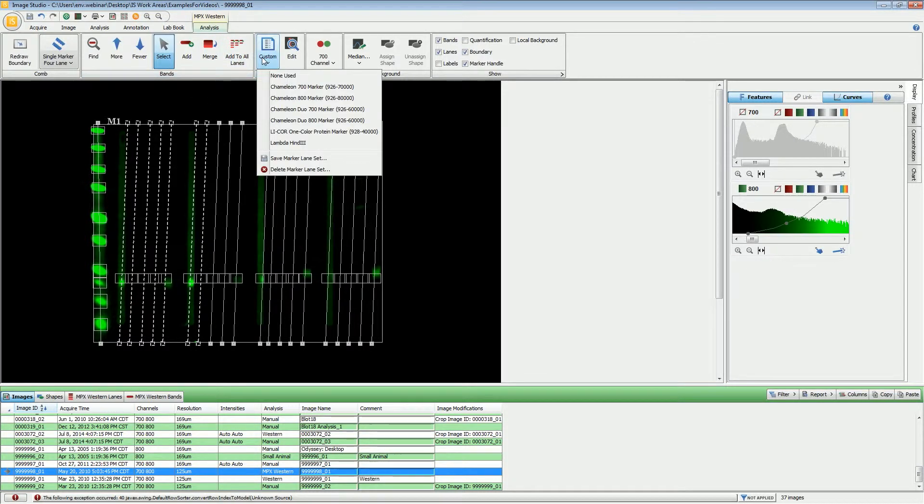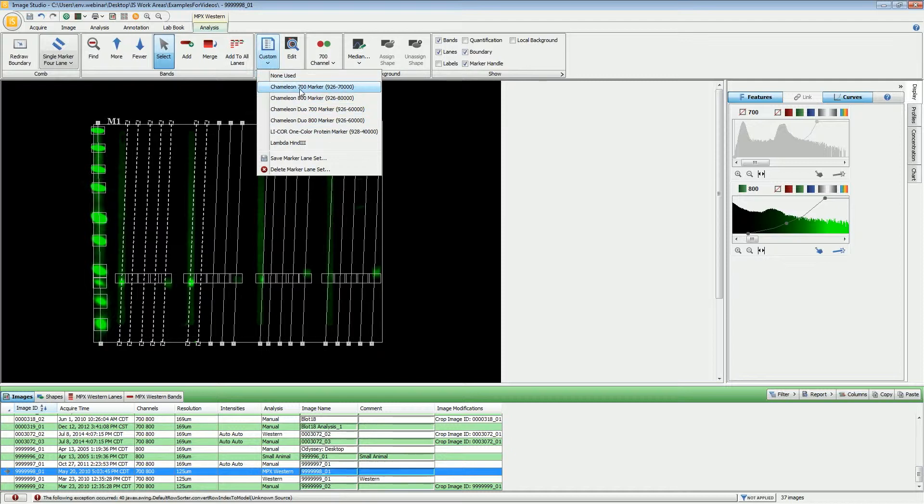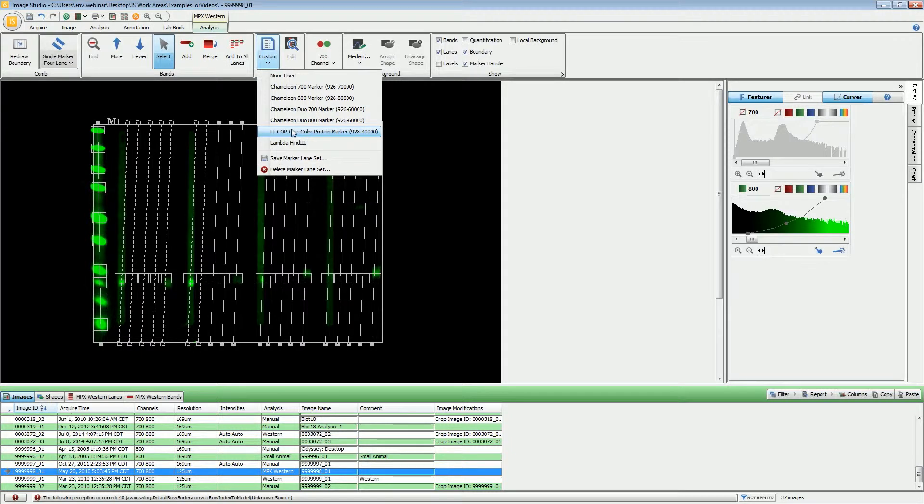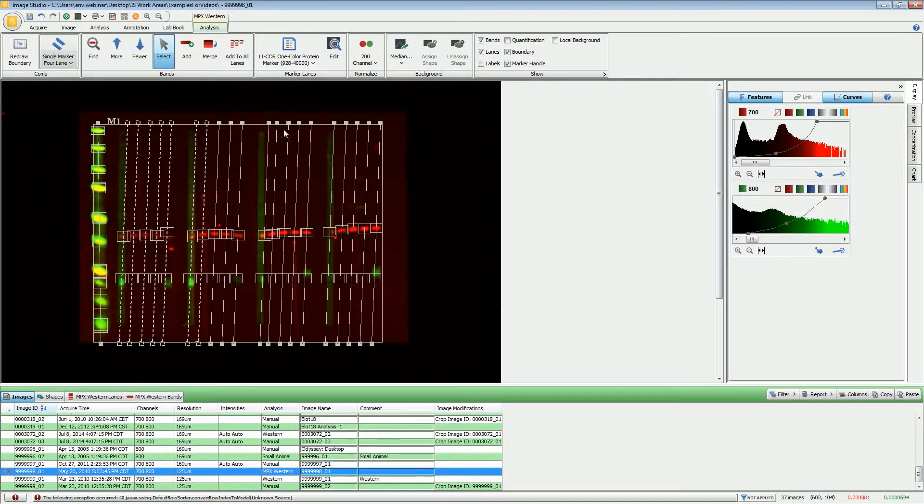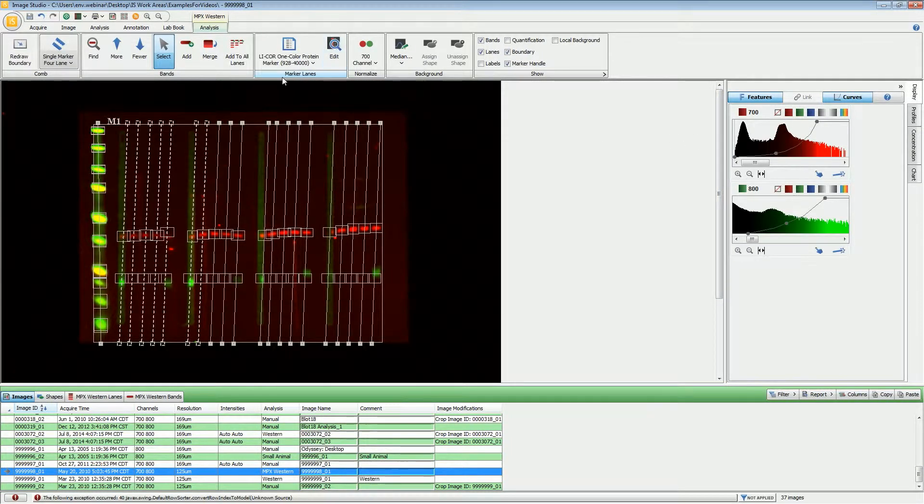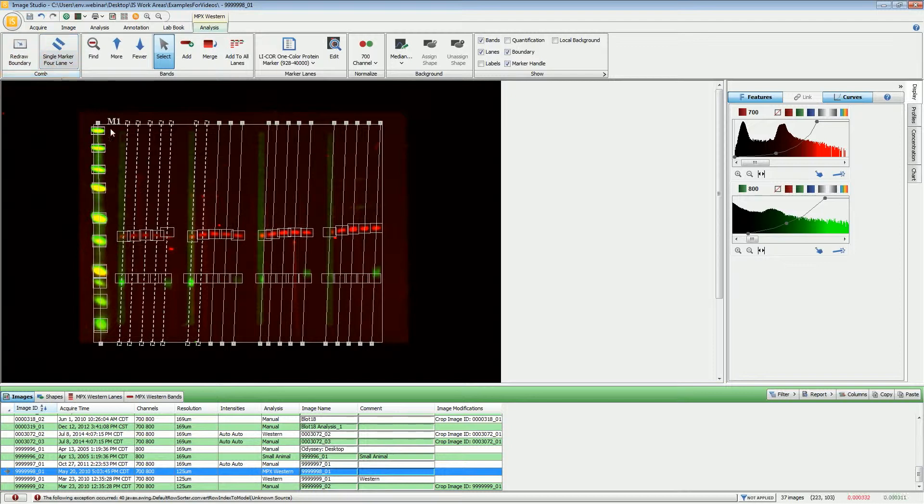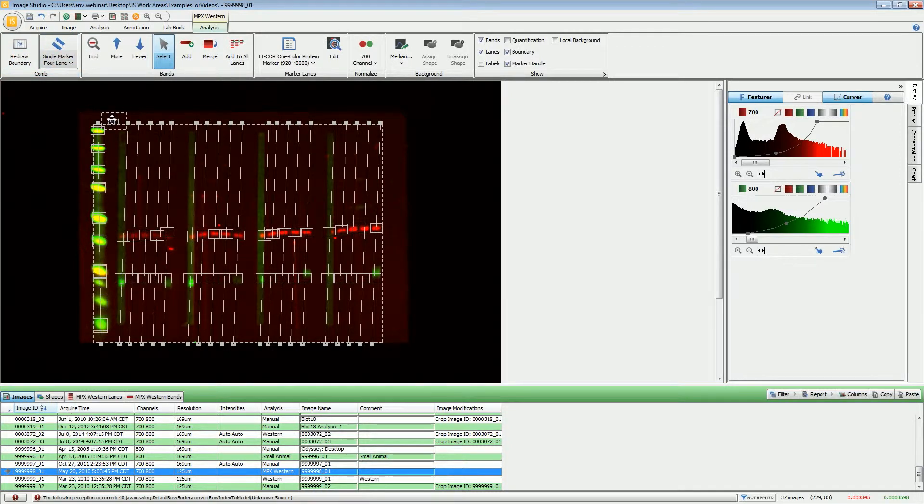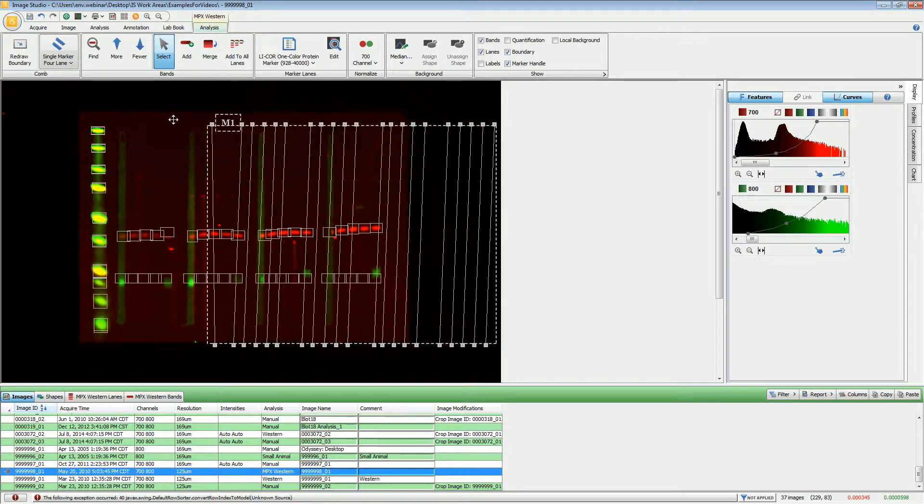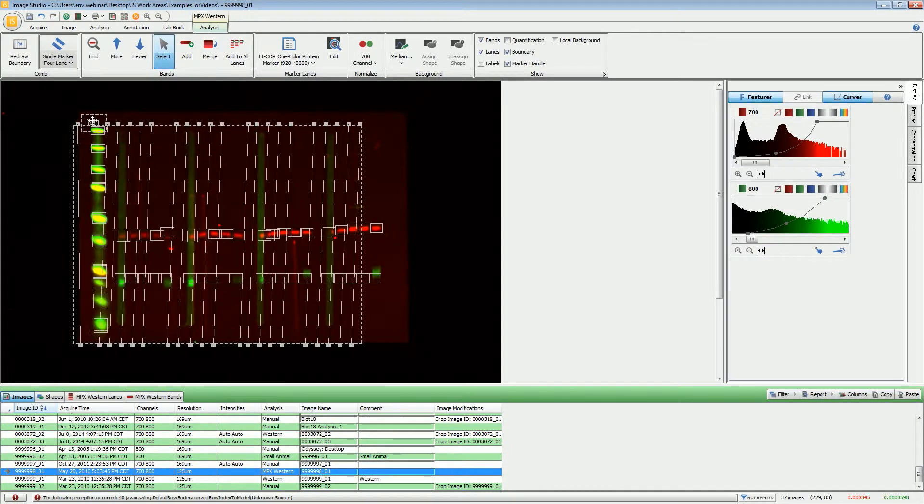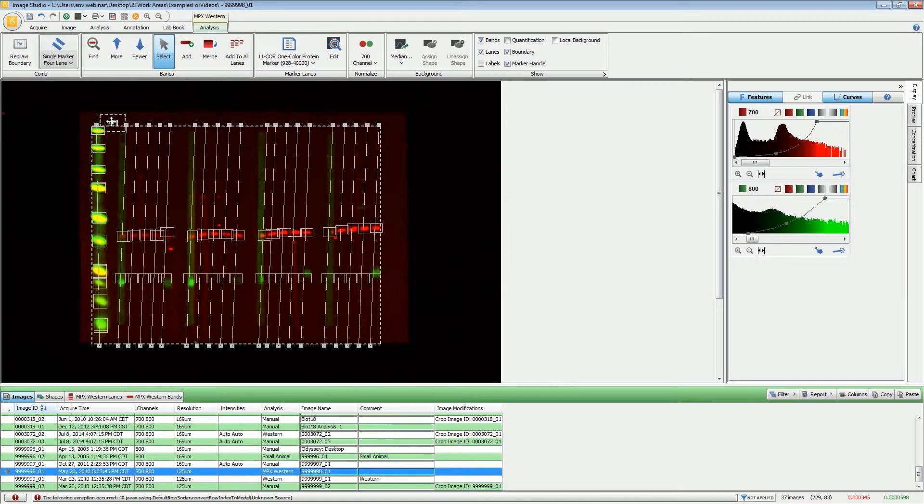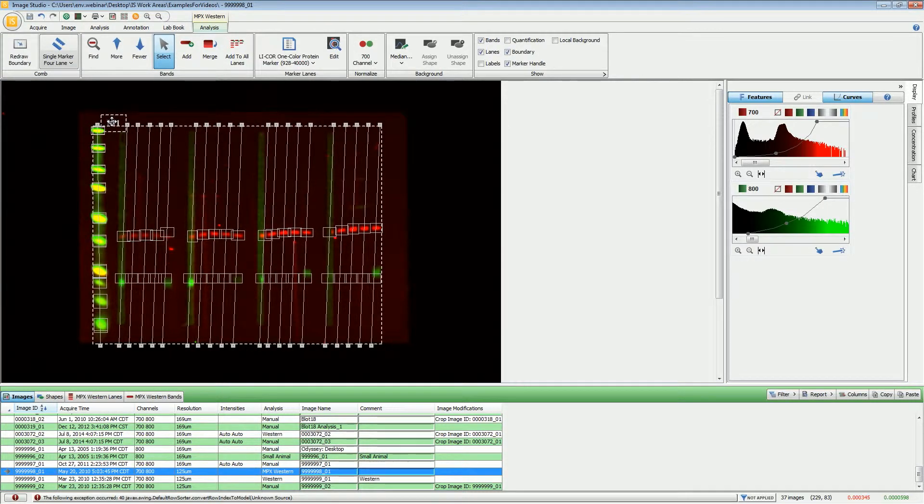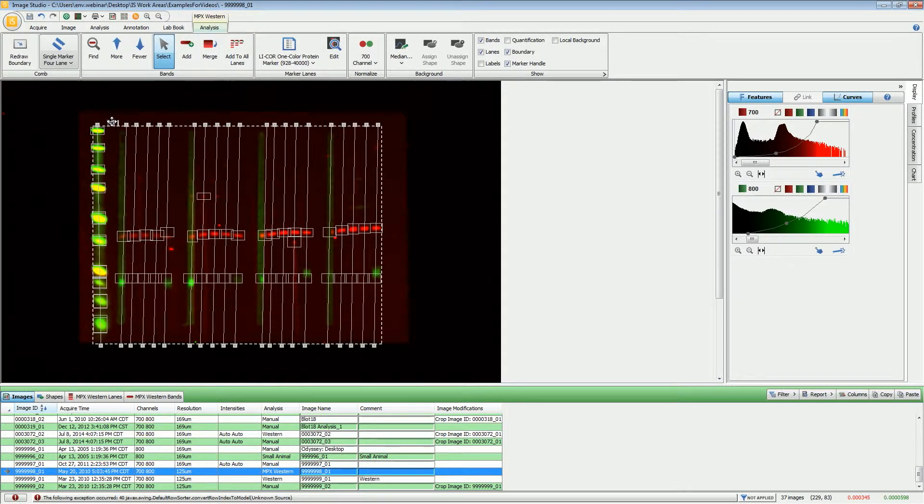Now for the marker lanes, I will be discussing the chameleon markers here in just a moment. But for right now, I'm going to go with the Lycor one color marker. Since this is a single marker lane, it puts it here in the left hand lane. If need be, if you did have the image reversed, you could move it as needed to get the correct placement of the marker.